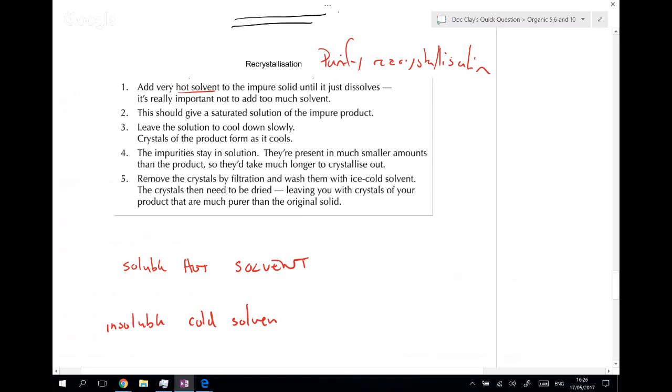What that means is that if you completely dissolve the substance in the hot solvent, you will have impurities that can be filtered out. And then in the leftovers, as you recrystallize here, the pure product can be filtered with our Buchner funnel as before.